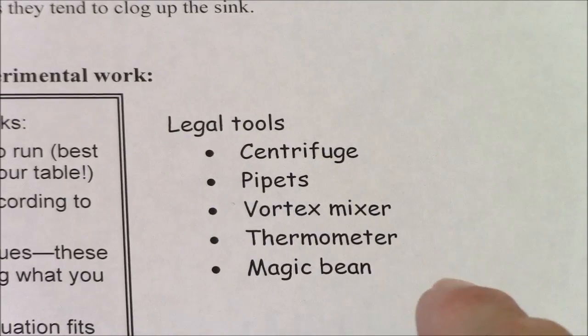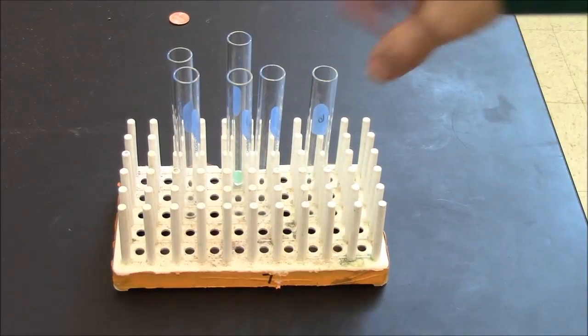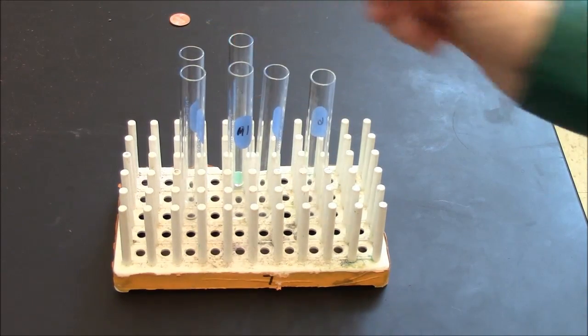Please also pay attention to the legal and illegal tools. I will be providing each lab table with 6 medium test tubes. These can go in the centrifuge.